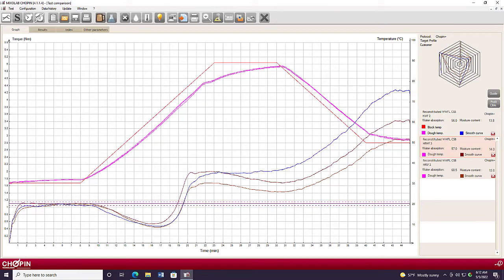The other function that you can use is the additive function. And so looking at things like vital wheat gluten, L-cysteine, enzymes, things like that. If the flour is not fitting your ideal profile, this function will help you identify an additive strategy that might help to correct some of the deficiencies of that flour.